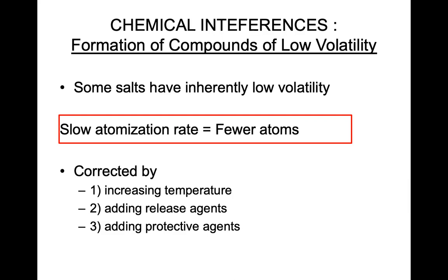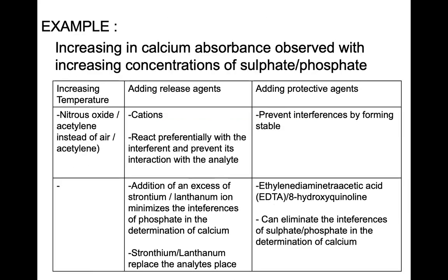So we need to use these techniques: high temperature probably, release agent and protective agent. I don't know much about this because I never had any experience using it.